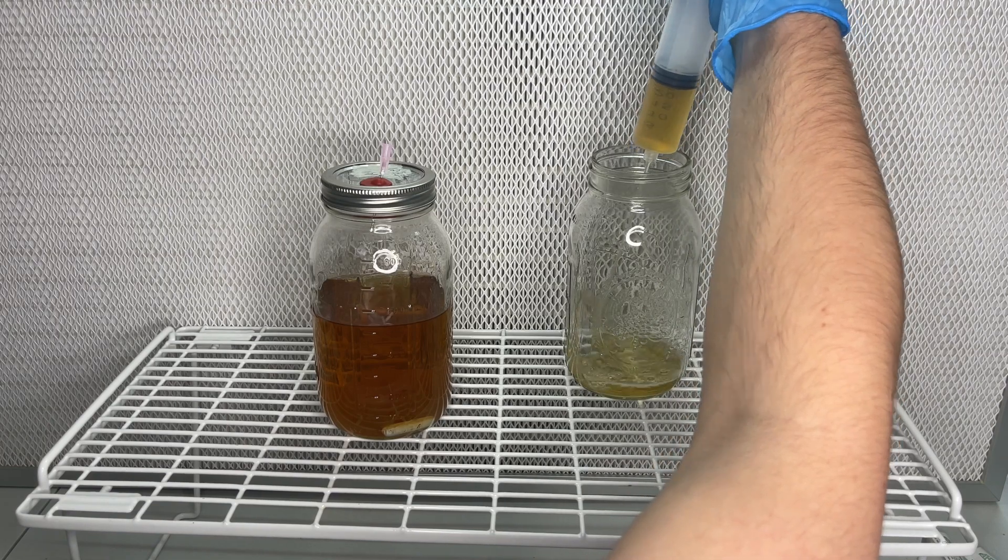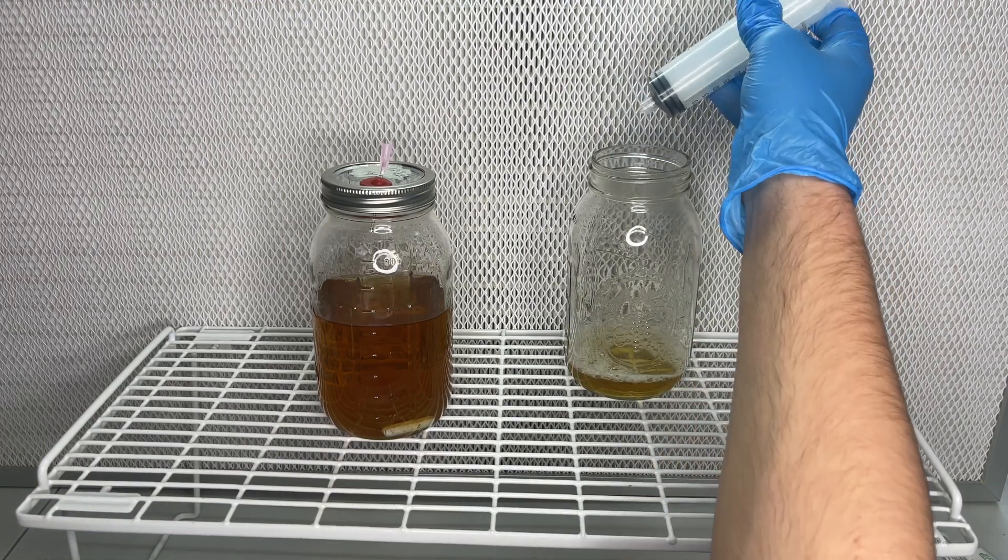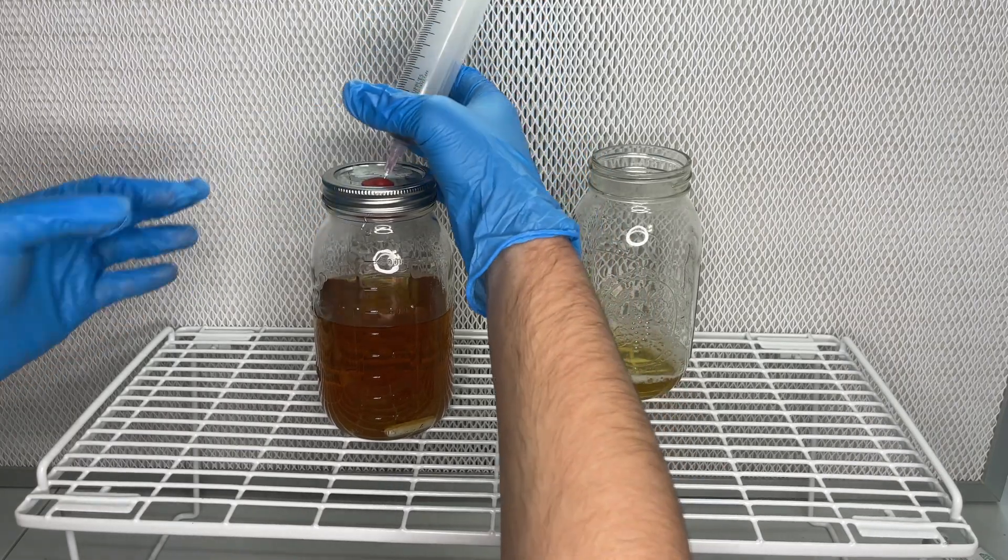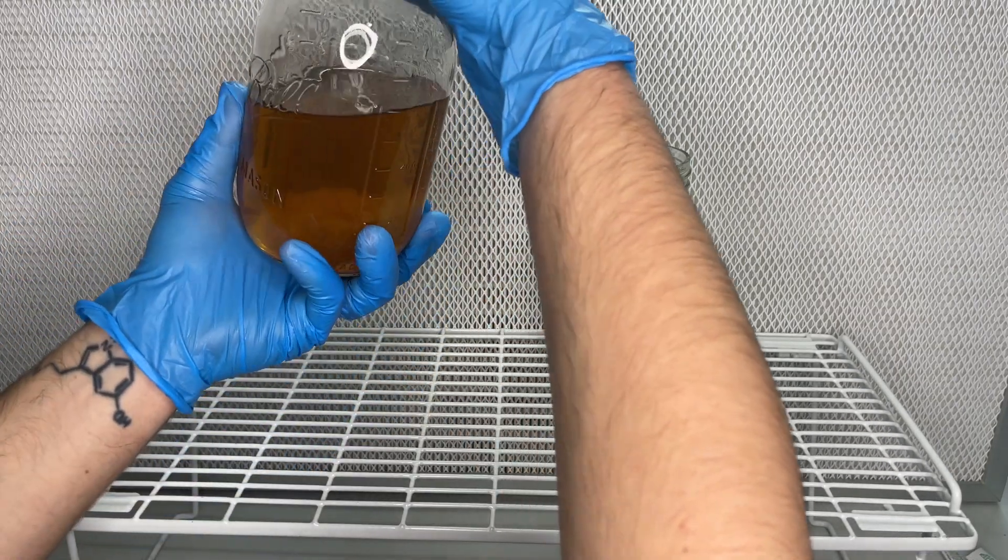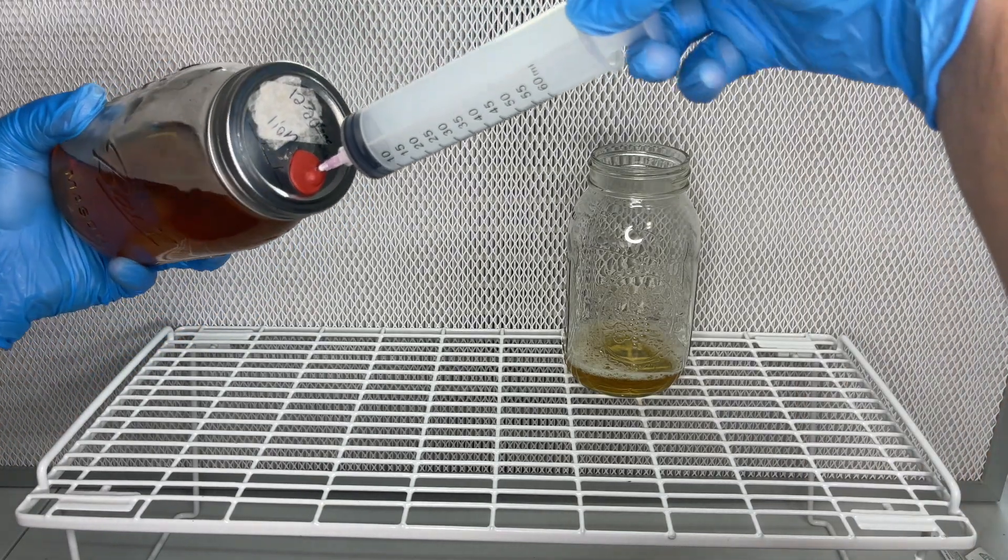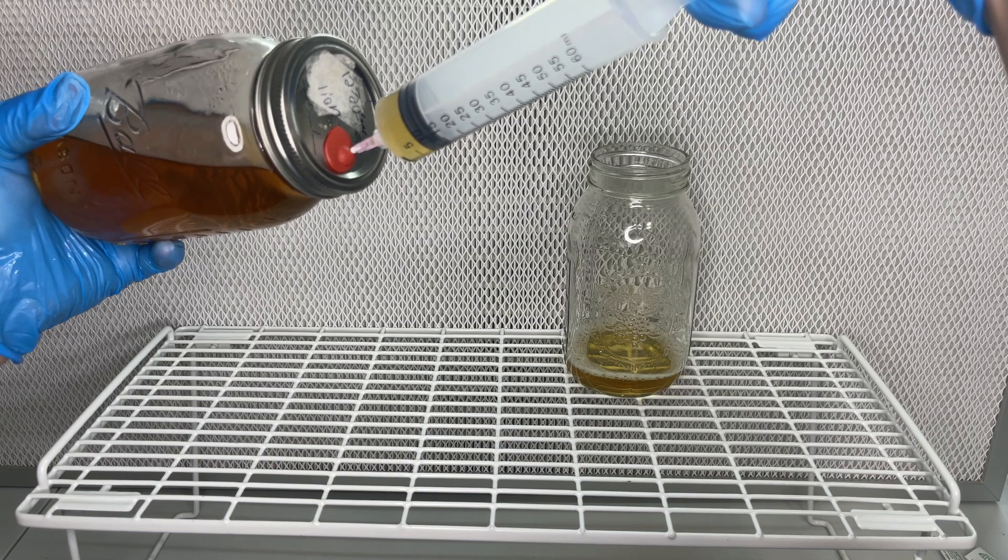You can leave the needle in the injection port, and just twist off the syringe when you're discarding the extra liquid. Each time being careful not to move the jar around too much so that I don't disturb the mycelium at the bottom.